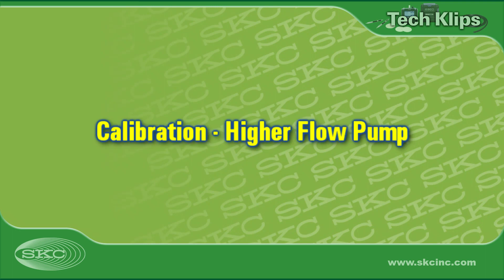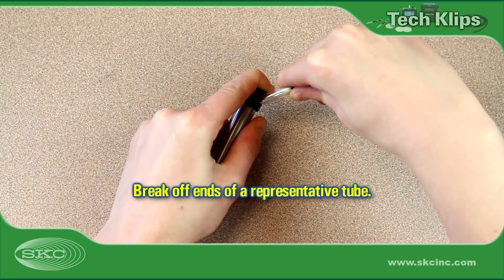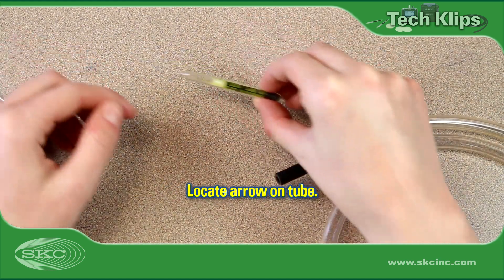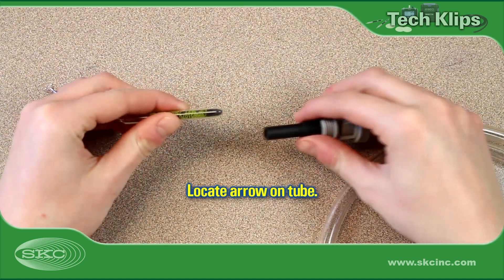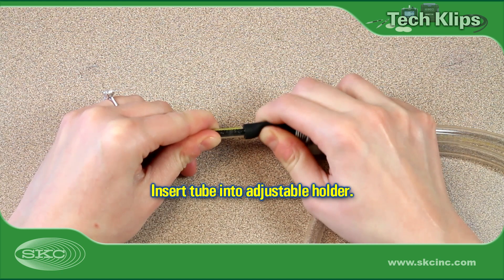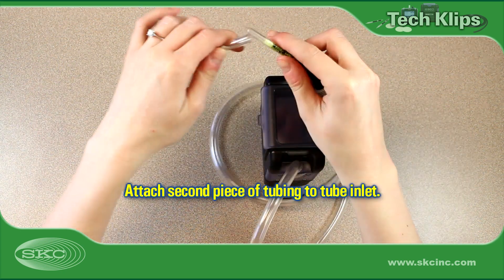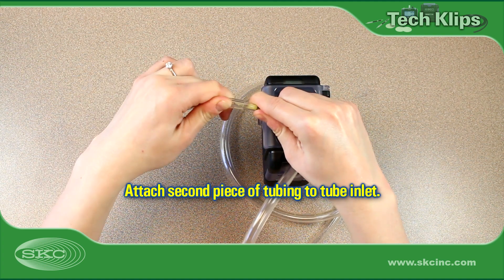Let's now go over how to calibrate a higher-flow pump that does require the use of a low-flow adapter kit. As with all air sampling, it is best practice to calibrate pump flow rate before sampling and to verify flow rate after each sample. Use a tube breaker to break off and retain the ends from a sorbent tube representative of the tube to be used in the field. Locate the arrow printed on the sorbent tube and ensure that it points toward the pump. Insert the open sorbent tube into the rubber sleeve of an adjustable tube holder with CPC, such as the SKC All-in-One, to adapt the higher-flow pump to low flow. Connect the tube holder to the pump inlet. Attach a second piece of tubing to the open end or inlet of the sorbent tube.